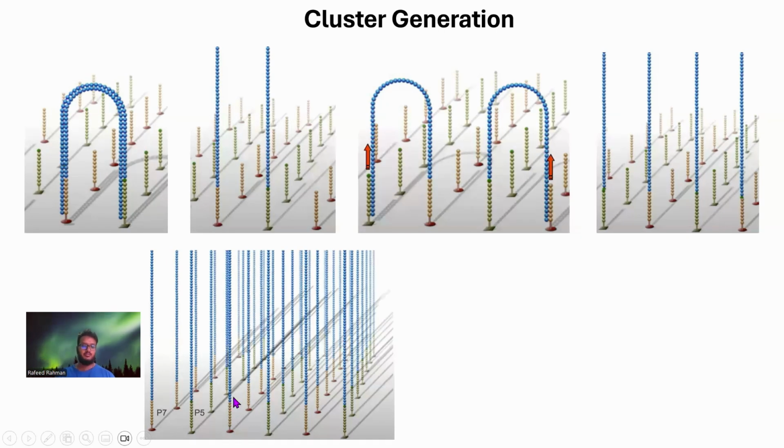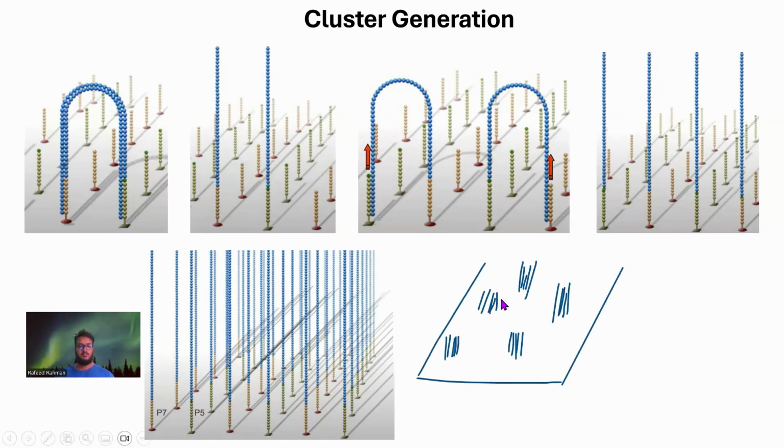So the single cluster is for one strand of one fragment. This is a very poor picture, but it drives the idea home. If you have only 5 strands of 5 fragments, then there will be 5 clusters like this, right? In each cluster, there will be the same copy of the same strand multiple times. So this is the process of cluster generation.